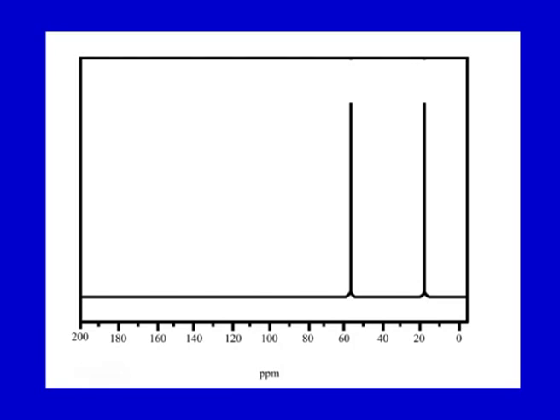If there is more de-shielding due to an electronegative atom, then there is a shift. You can see there are two peaks for the two carbons, and one is shifted to the left, which is connected to the electronegative atom, rather than the other carbon which is simple. So, these are the peaks obtained, and it depends on their electronic environment for carbon, or say for proton NMR, where the proton acts as the nucleus which is resonating.